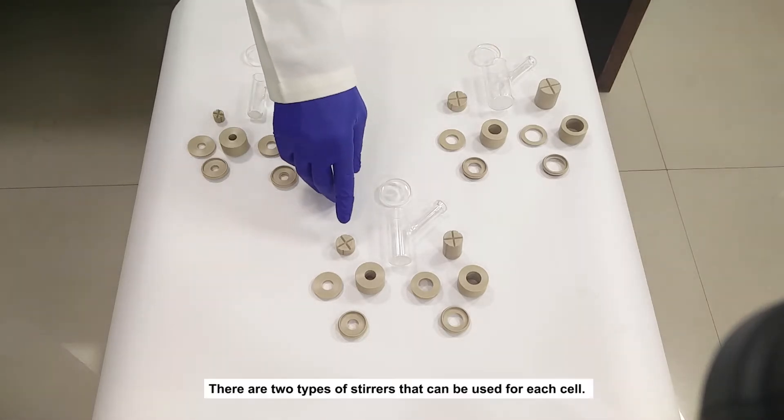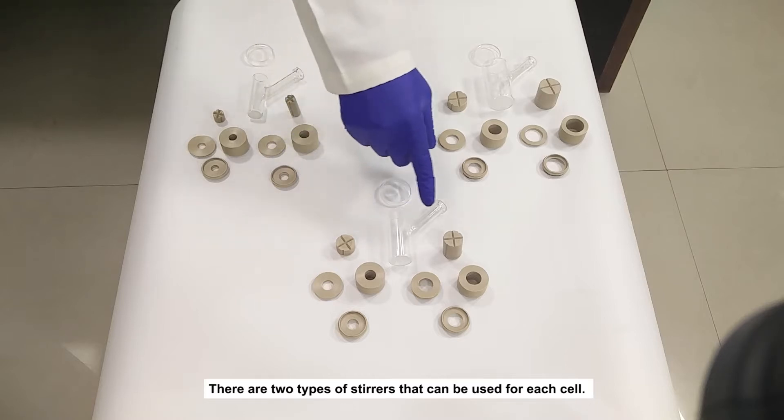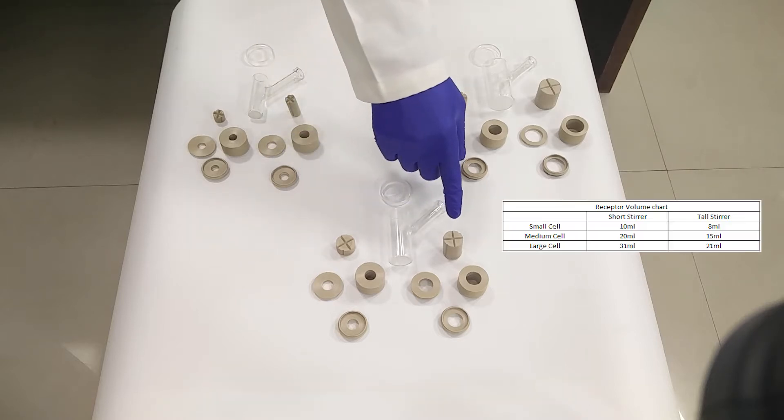There are two types of stirrers that can be used for each cell: short or tall stirrer. Depending on the type of stirrer, the cell volume changes.